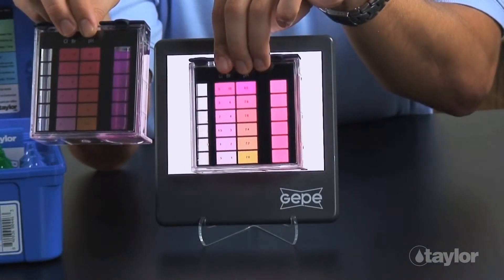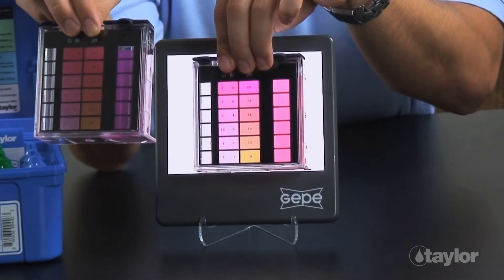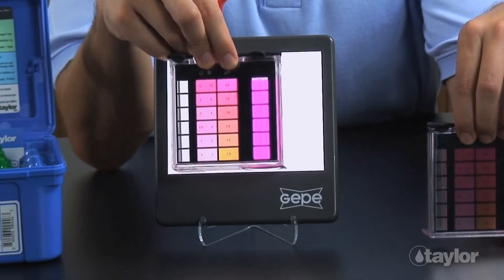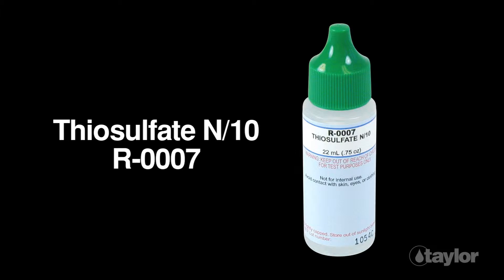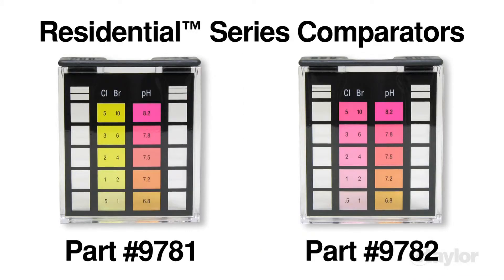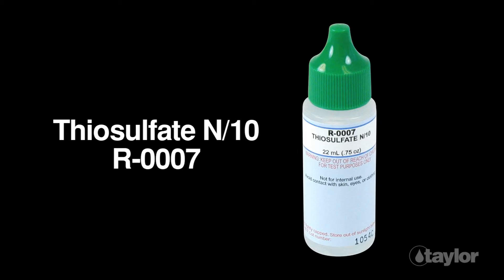If this bluish purple color develops, retest, but first thoroughly rinse the comparator and cap to avoid contamination. Then, add one drop of thiosulfate N over 10, reagent 7, to the new sample if using a 2000 series comparator. For a residential series comparator, add one drop of reagent 7 to a 50 ml sample.